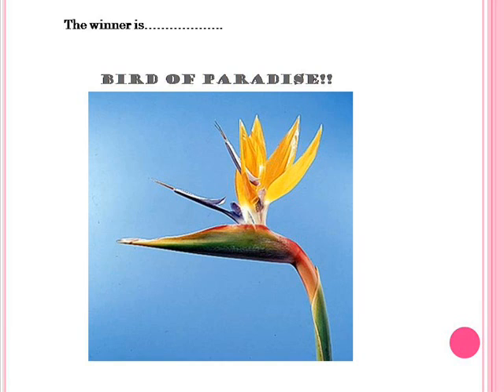And the hardest flower would have had to be the lilac, which was the smallest flower too. So it was very hard to get the pollen out.